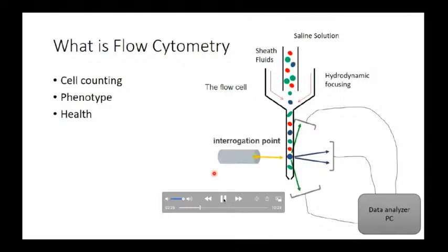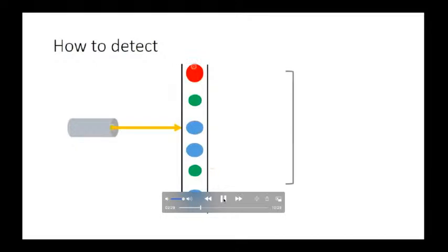Now I'm going to speak in more detail. Saying that this is the flow cytometer tube, the cells pass one by one through the laser beam. When the cell passes through the laser beam, the cells scatter the light in a forward direction, which is the light scattered in an acute angle. This forward scattered light is directly proportional to the size of the cell. Why?